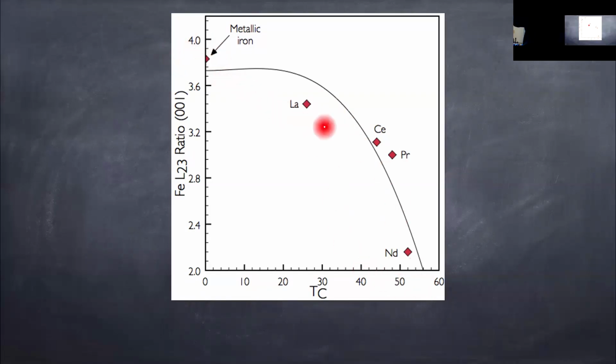And you can see a very interesting behavior. Why is it like that? It's because of the bonding, the orbitals on the d states, how they are bonded, and for this case it is tetrahedral coordination. So I always get confused between the eg and the t2g, which is lower, or is it the other way around? It's octahedral. No, sorry, it's tetrahedral. Then the t2g is higher. So it depends on the way that the t2gs and the egs are being bonded with respect to metallic iron.